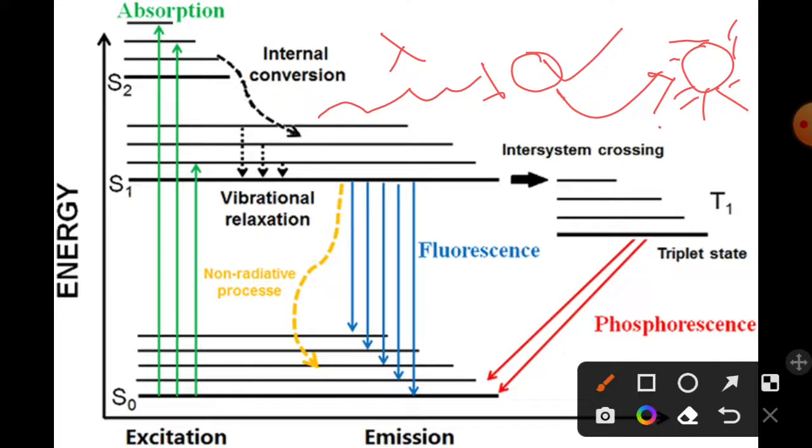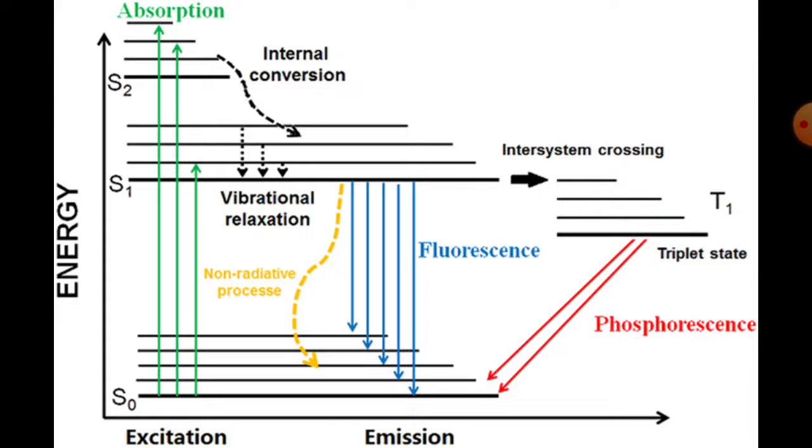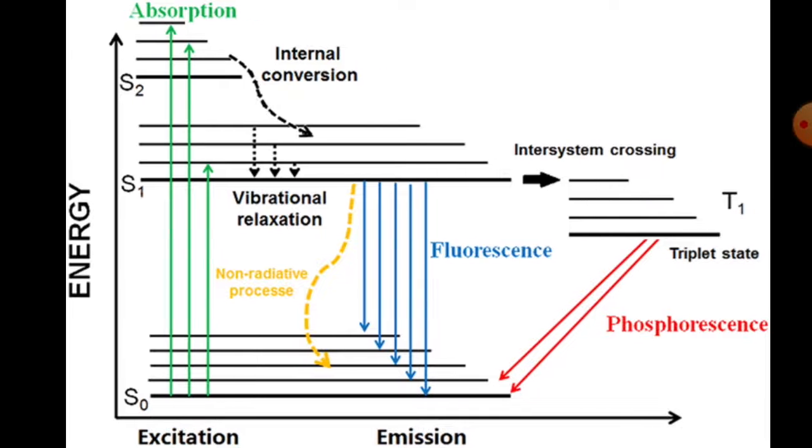Now this excitation state is an unstable state, I have told you. So it will immediately remove all the trapped energy that it contains inside in the form of light, and this light is known as emitted light. This emitted light we will use to create an image of the specimen with the help of fluorescence microscopy, that is the idea. Now let me tell you that there are two kinds of fluorescence microscopy available. One is epifluorescence microscopy, another one is transmitted fluorescence microscopy.